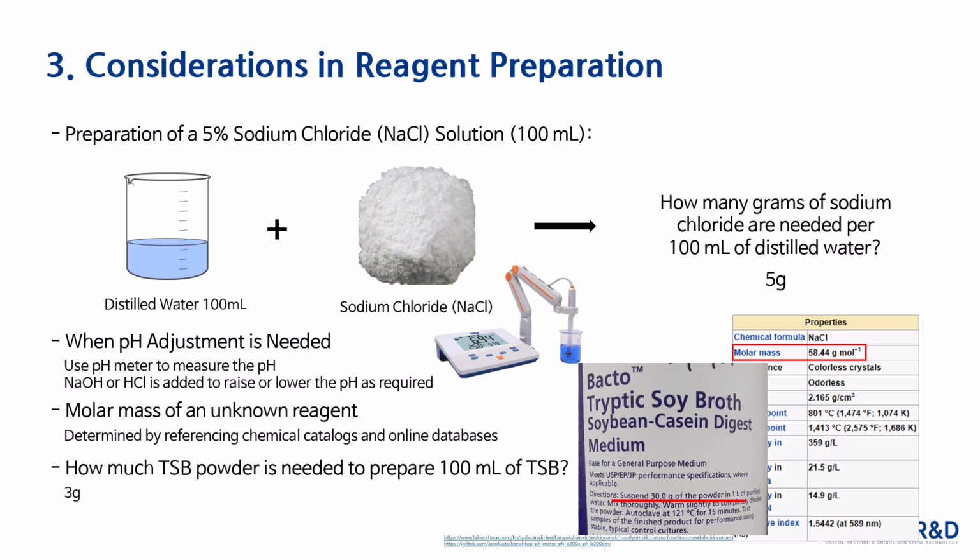Today, we covered the importance of buffer solutions, the concept of concentration, and key considerations for preparing reagents in microbiological experiments. Understanding these principles is essential for ensuring accuracy and reliability in experiments.